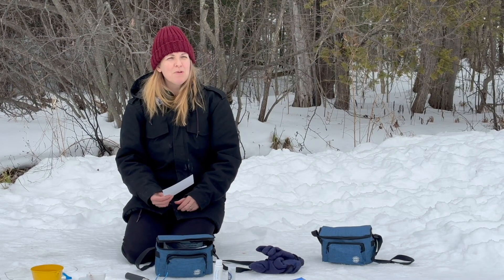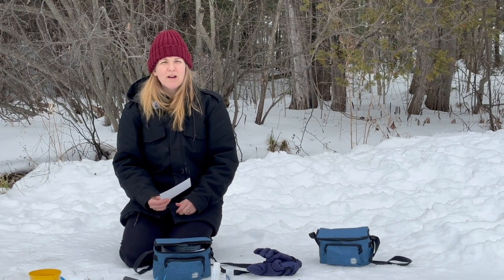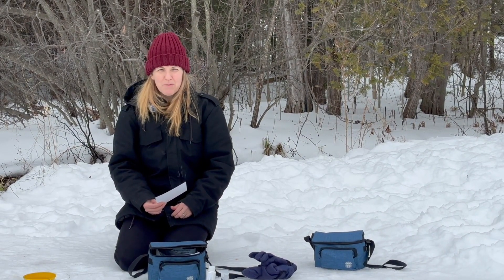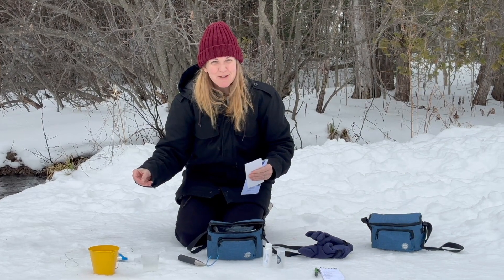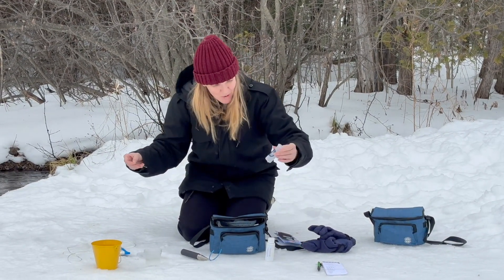To interpret your results, check out your guide. You really want to know the difference between a reference point and your area of interest. A lot of people doing road salt monitoring are looking before and after a road. Please be patient to make sure you get your full reading.